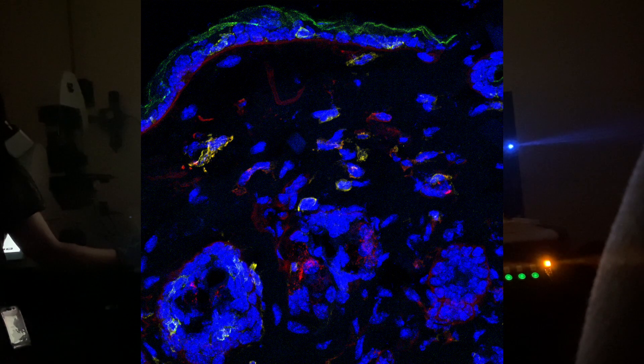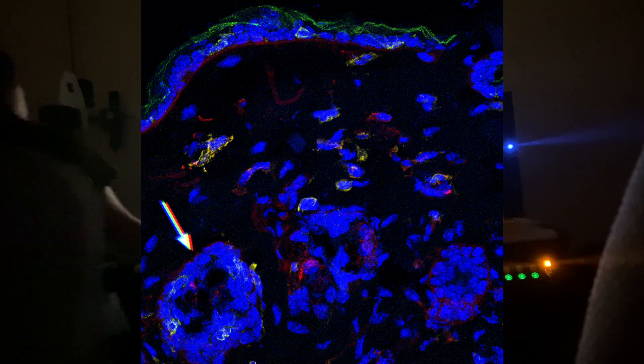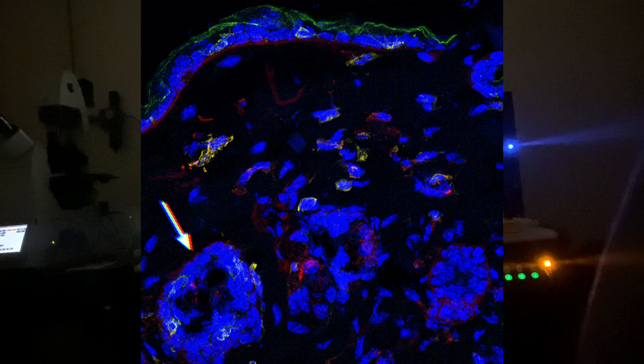In my case, I'm looking at a sample of skin with tumors. I'm using fluorescence imaging. So I took a piece of tumor skin and prepared it in a way that lets me identify specific proteins or types of cells in the skin tissue.